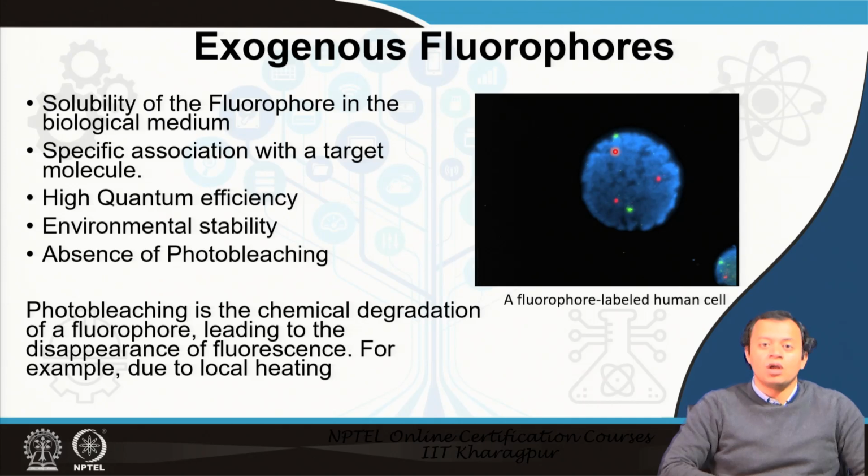Laser scanning, confocal microscopy, you do it here, and how much super resolution will you get, especially if you bring the objective of your lens within 50 nanometer of that particular sample? What do you think you will get? Can you do that? Now, remember, 50 nanometer is a run of the mill term.